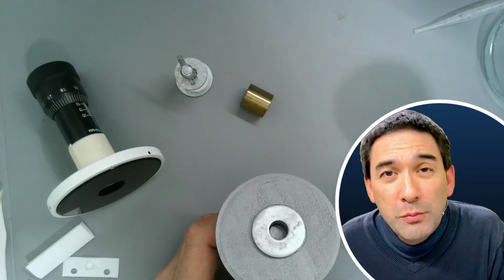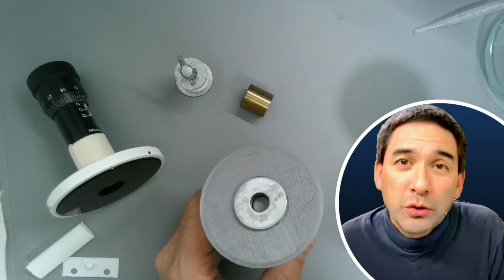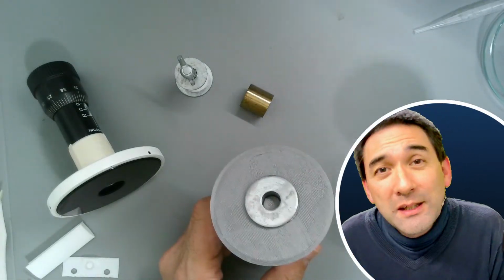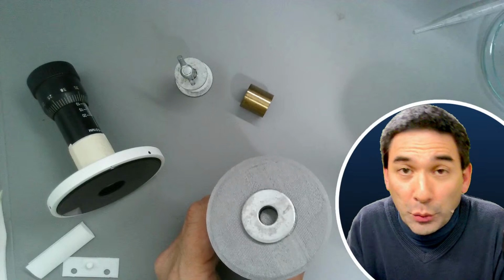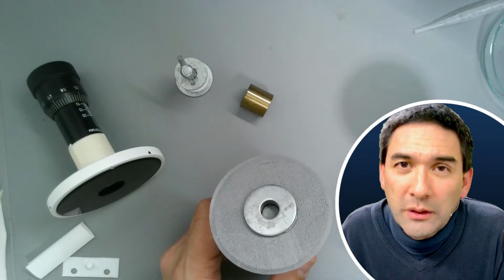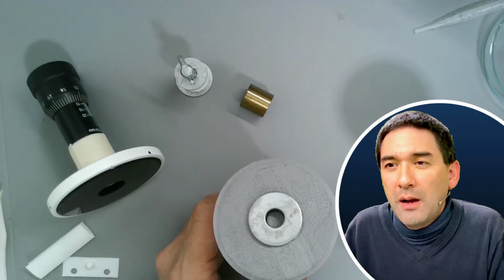In the tropics, where the humidity is almost 100% all the time, and quite moist there, you indeed have problems over the long-term use that some microscopes might start to grow some fungi on the microscope optics. And the problem apparently is so big that some microscope manufacturers even coat the optics with antifungal coatings so that the fungal growth is reduced. So I'm just saying that while I don't have to store it in a humidity controlled environment, I can understand that this might be necessary in some places.